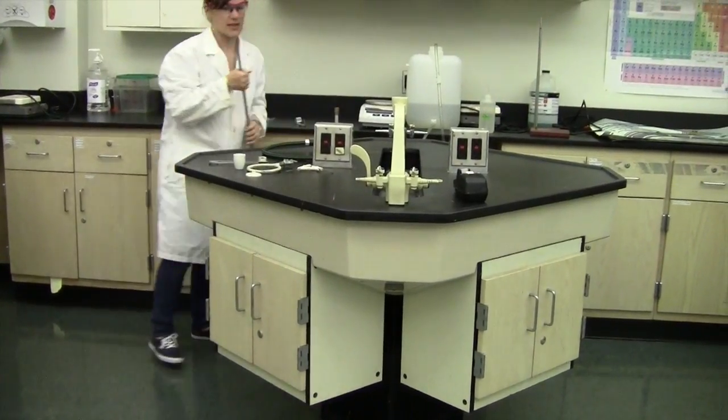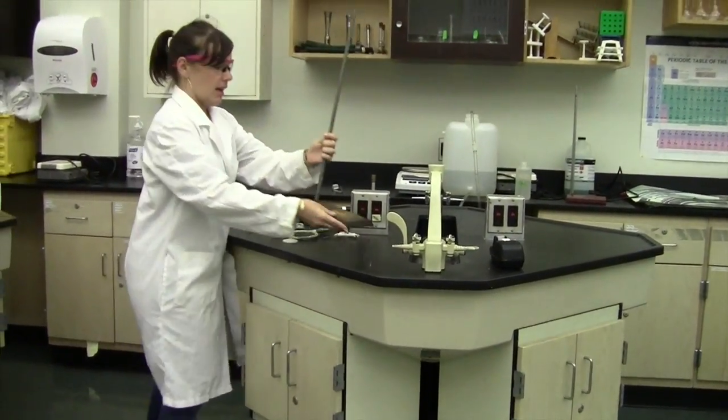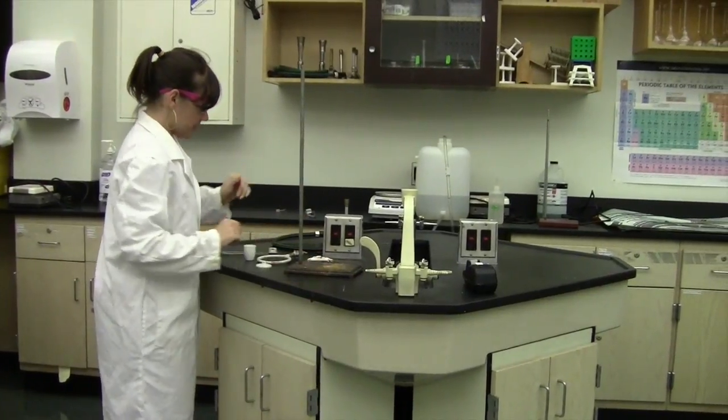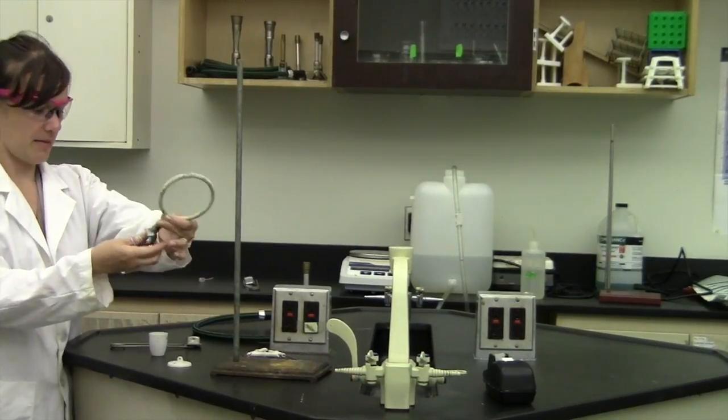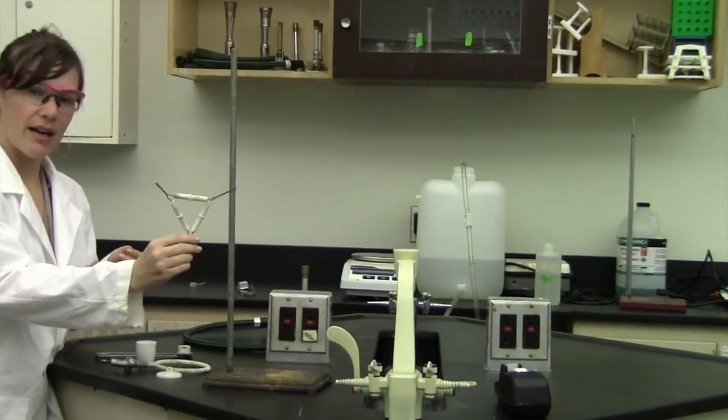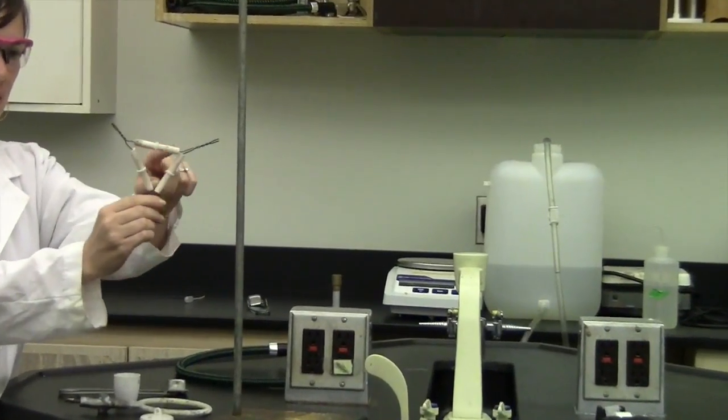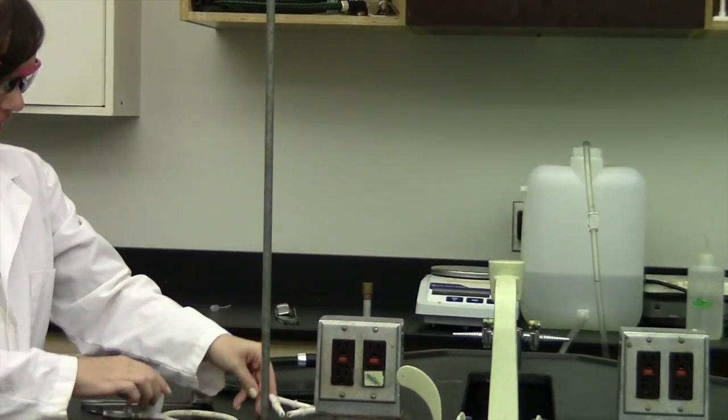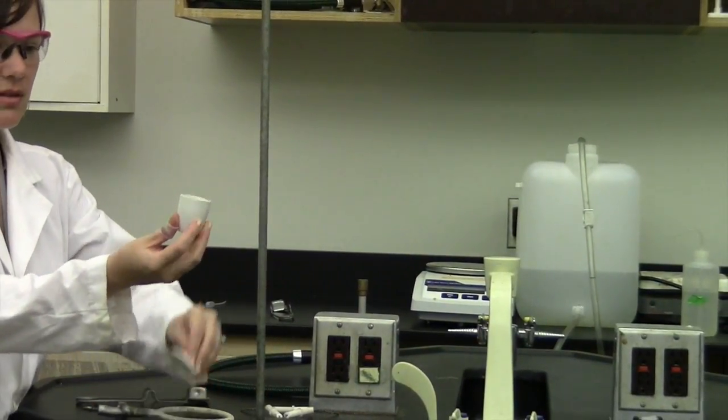We get our ring stand and then other pieces we'll need: a ring that has a clamp in the back of it, a clay triangle, and a crucible with a lid.